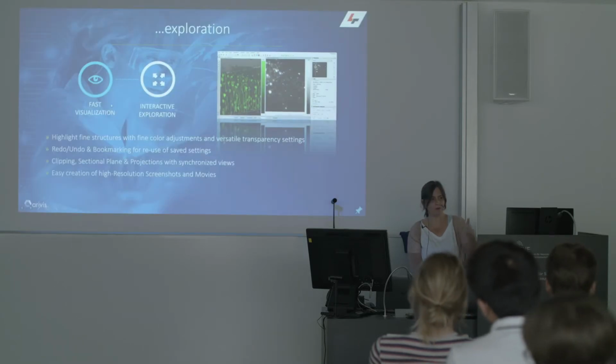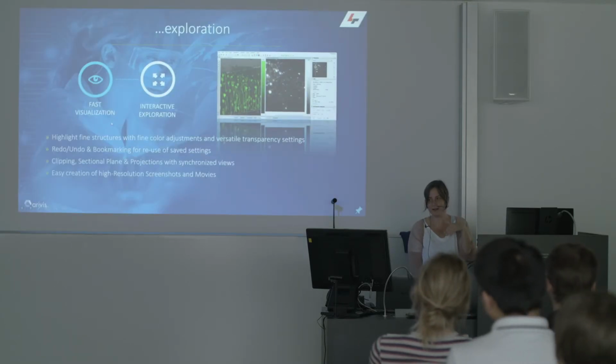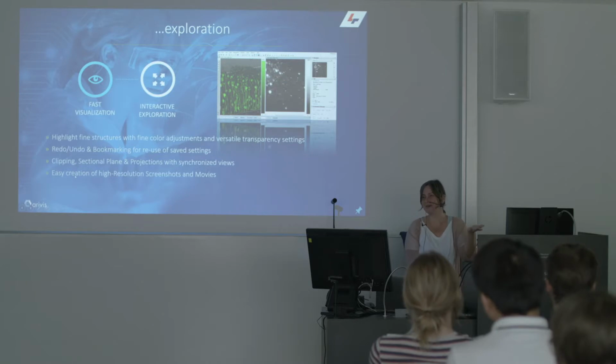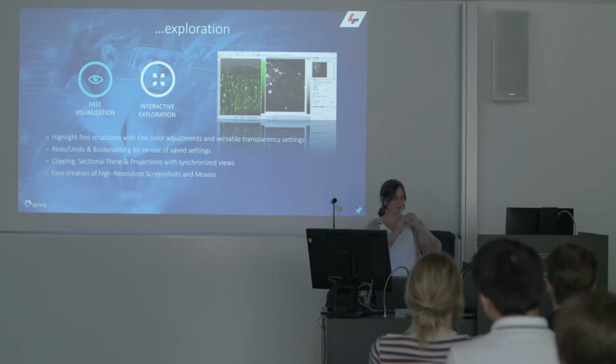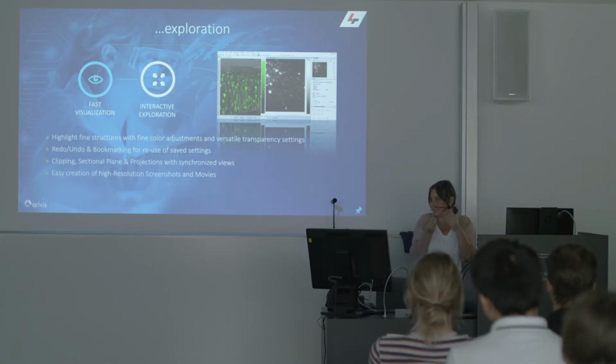So for you, in German we say, erstmal kleine Brötchen backen, so you will start small, right? So I'm also in consensus with Ali. I think you will not start with a whole mouse clearing. You will probably start with the single organ clearing, and that is just fine. The software should still handle it if it's not 1 terabyte of data, obviously.